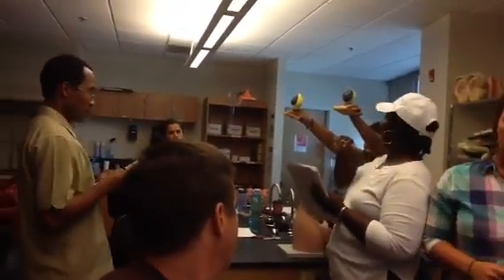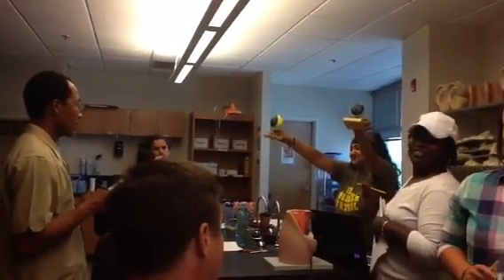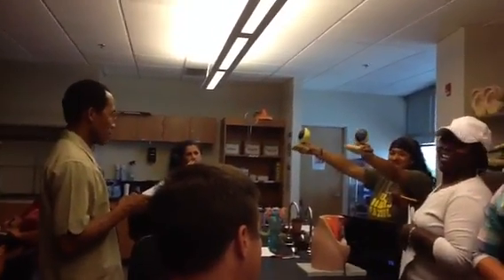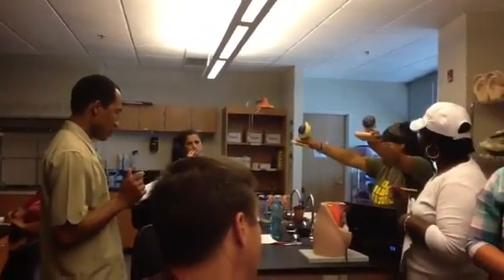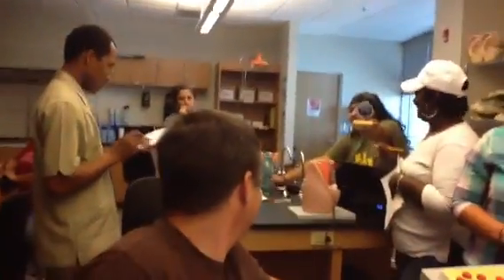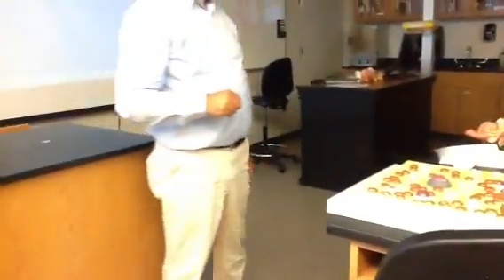And can you very kindly lift that one, my dear? These two are lymphocytes. The one on the right is small. So what will you call it? Small lymphocyte. And the one on the left is large. What will you call it? Large lymphocyte. If something is big, you call it big. If it is small, you call it small. Is that all right? So this is, ladies and gentlemen, basically the white blood cells. Okay? Thank you very much.